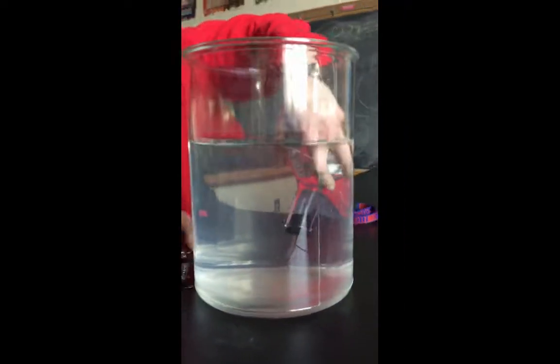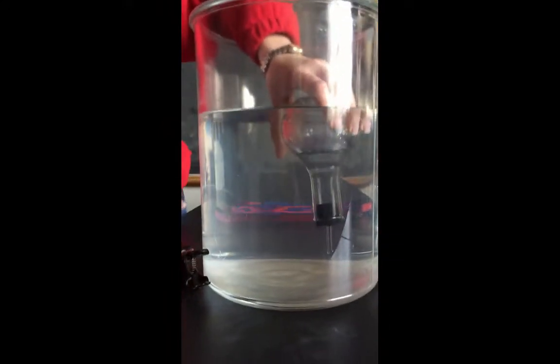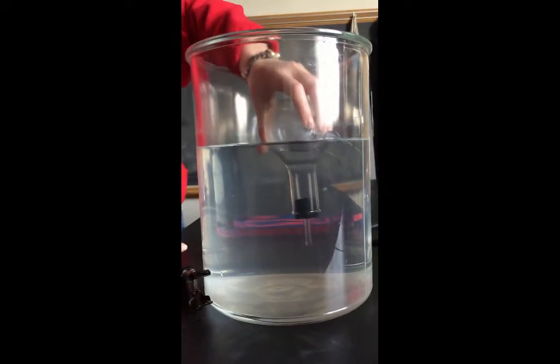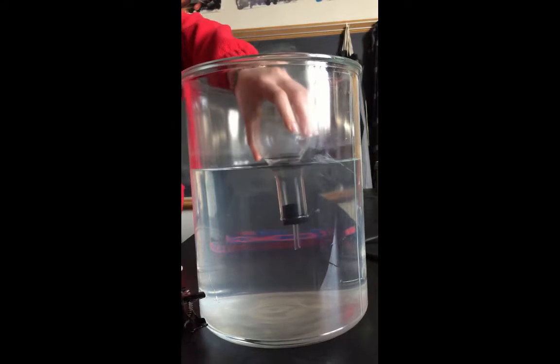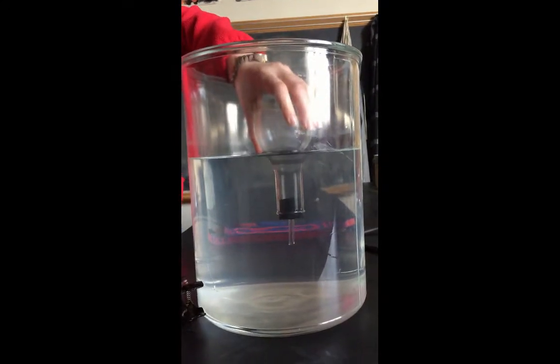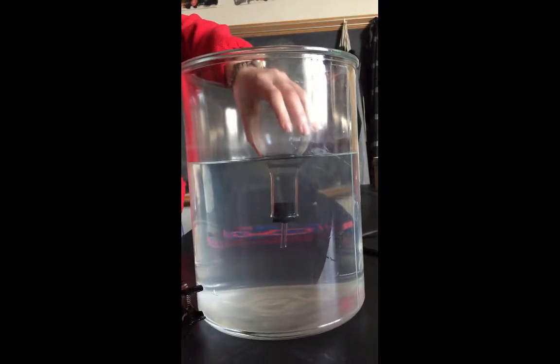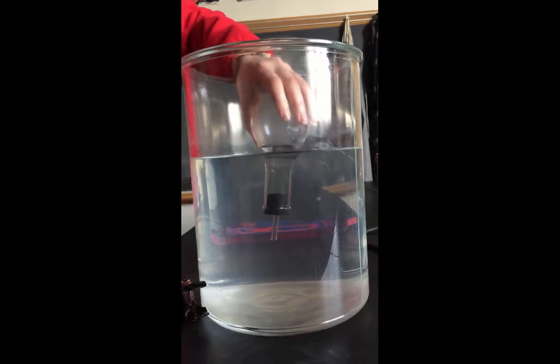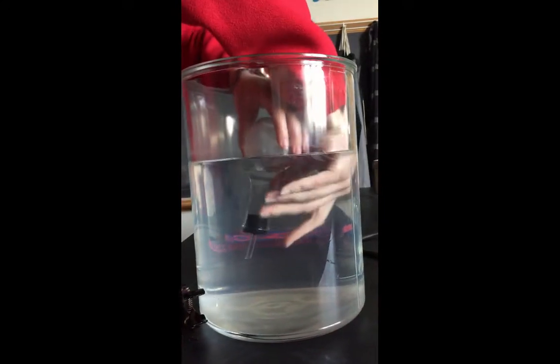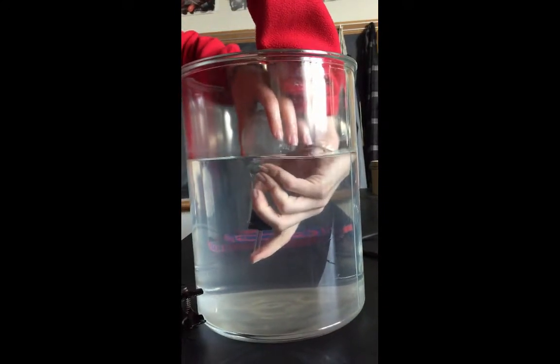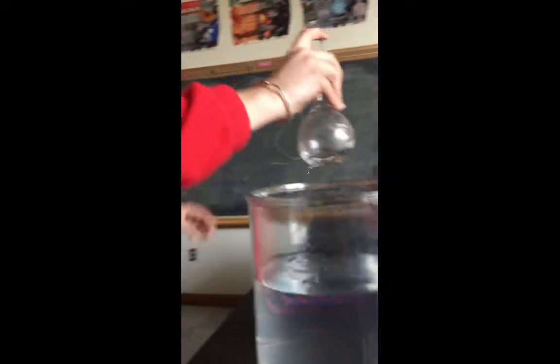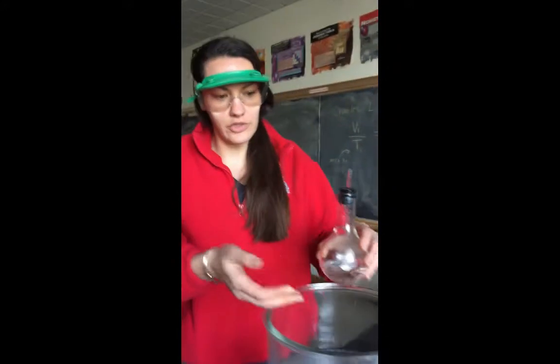Now we're going to line up the liquid levels. You can see the liquid levels are not even here, nor are they even here. We're going to make them equal so the pressure inside the bulb and outside the bulb is the same. I'm going to recap and now we're going to measure the volume of water that is in our flask.